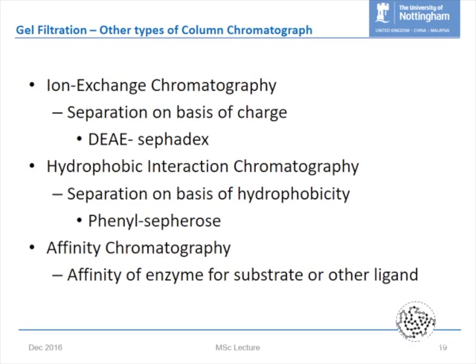What we tend to do is, when we inject our sample onto the column, we inject it in the weak solvent. And what happens in that scenario is all the molecules want to find a home on the stationary phase, and they're held up. Now I could continue to pump that weak solvent through my column, and they wouldn't move very much. They would take ages to come out. They're the molecules that are bound. The molecules that don't have a high affinity will go through the column, and you can see those.